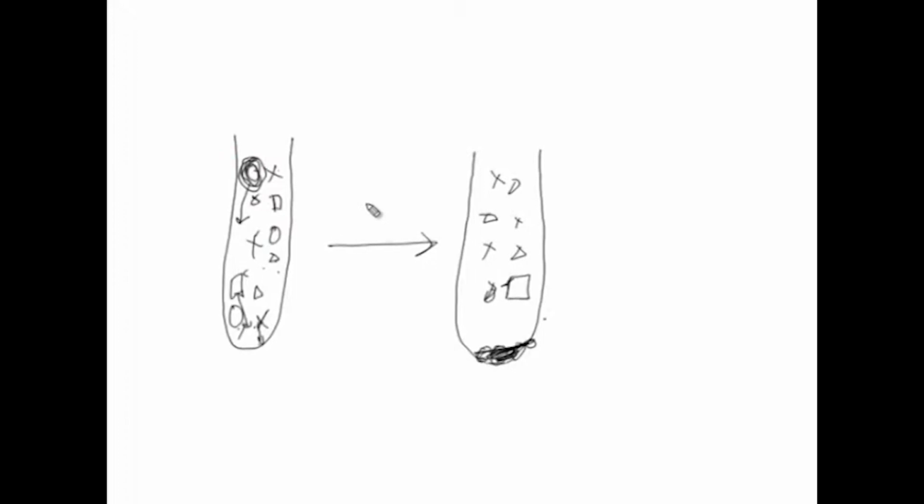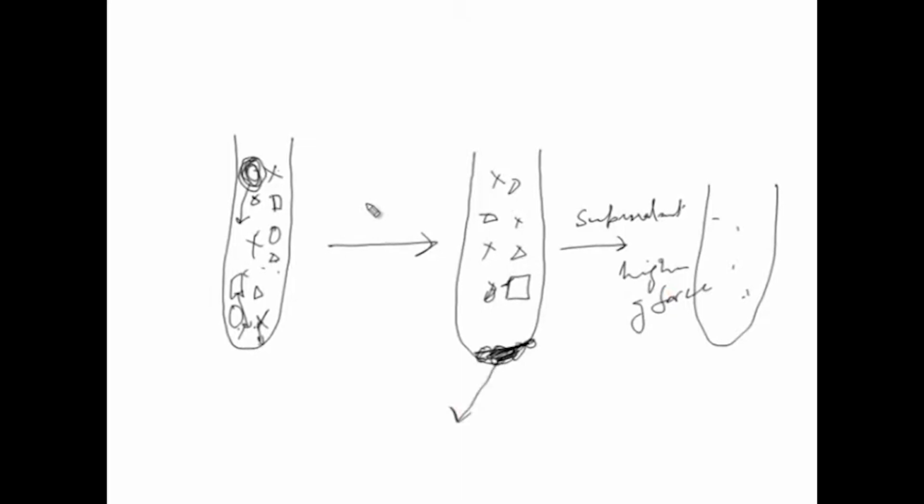So, what is done to get purification is that you take the supernatant, decant it into the next tube, and centrifuge again at a higher G force, say 10,000 G or whatever it is. Likewise, you take the pellet and homogenize it again in a suitable solvent or medium. This pellet will contain more of the larger particles, but it will also contain other smaller ones.